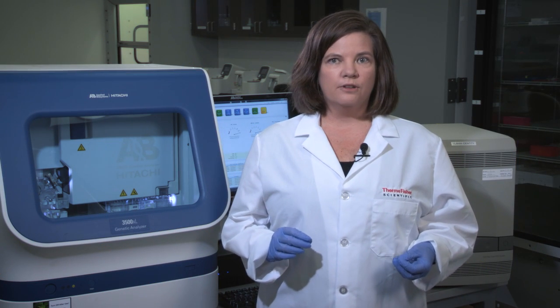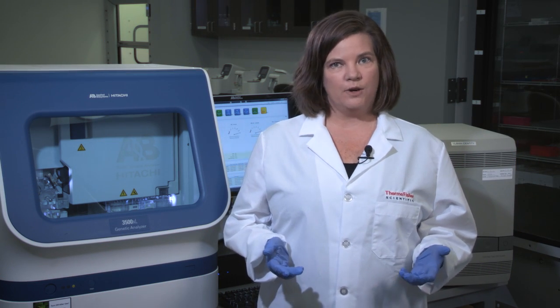The CT values of your standards affect the slope, the y-intercept, and the r-squared value. It is very important to prepare the standard dilution series carefully to ensure consistent and accurate results.